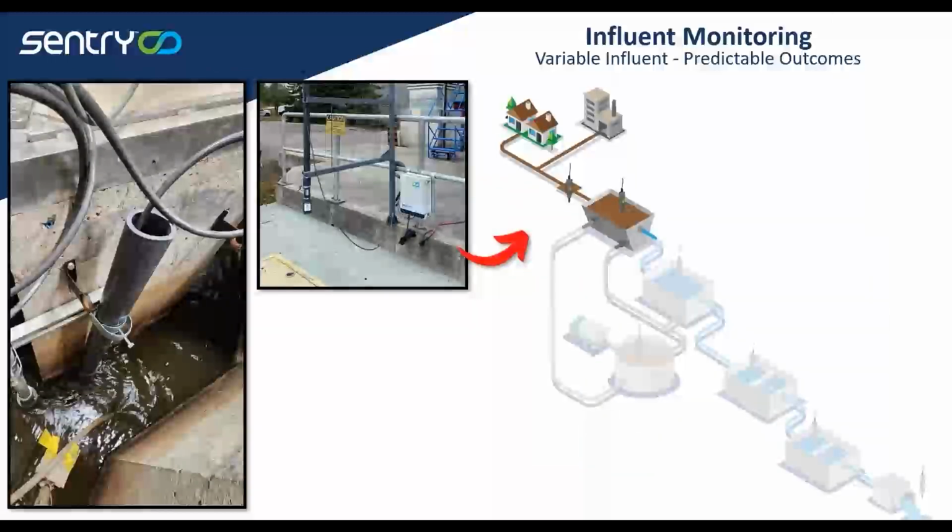And that becomes powerful because most of our deployments are at the influent monitoring. About 70% start with or include influent monitoring, and that's a great place to understand what's coming into the plant from an overall quality perspective, and whether you can take action early enough, in terms of changing blower speeds, dosing chemicals, and various other treatment process techniques at disposal, like diverting to EQ tanks.